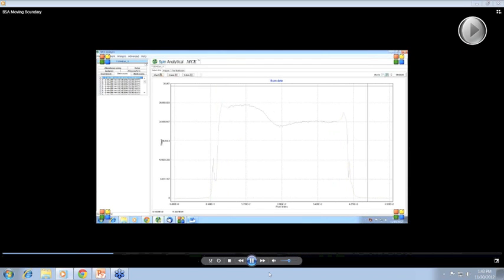And pause it right here. Where the protein has already gone by, the light intensity coming through is higher than over to the right, where the protein, where the boundary has not passed. We have 512 light intensity measurements across the entire sensor, and approximately 200 to 250 light intensity measurements across the 4 millimeters of the cuvette.